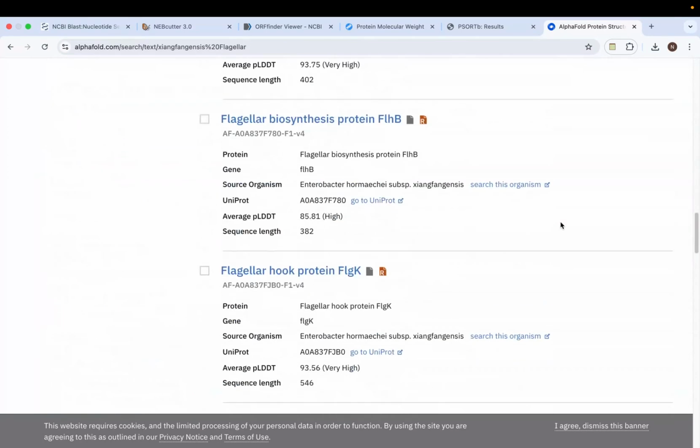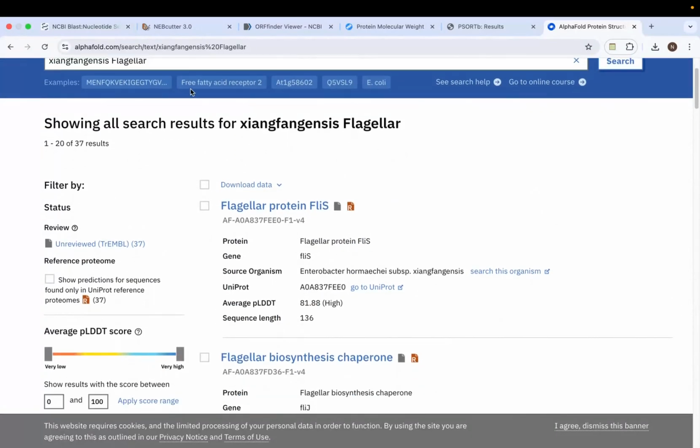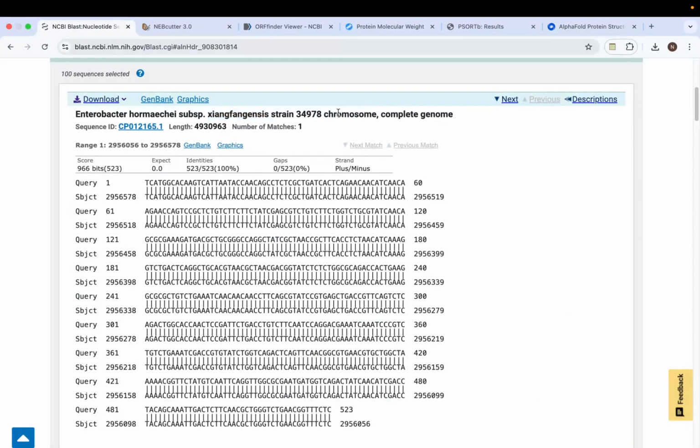Yeah, again, there will be a lot of results, and again, I pulled whatever this sequence is off the internet, but yours will be a bit more straightforward. For example, when you search up your DNA sequence, it might also come with a gene, maybe like FLIC or FLIJ, whatever it says. It might be ideal to match the gene, whatever it says on this title. So in this case, it doesn't say what the gene is, but for my assignment, it did, which helped me identify the correct protein.